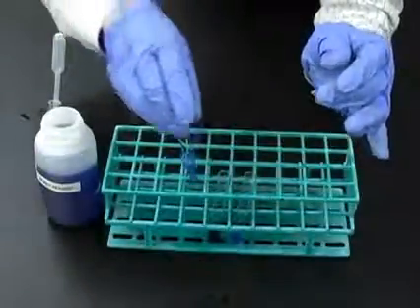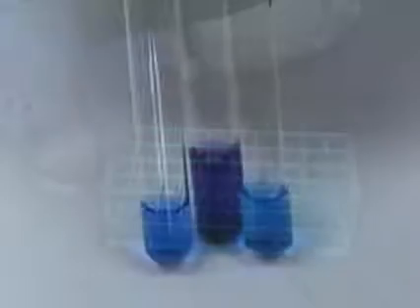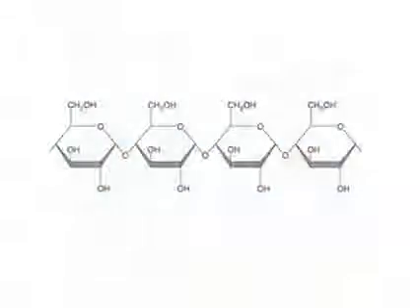Agitate each mixture by shaking the tube side to side. Wait 2 minutes and then take notice of the color of the mixture. You see the positive control, egg albumin, turns a violet color. What color do you see in the unknown solution? Does this indicate a positive or negative result?